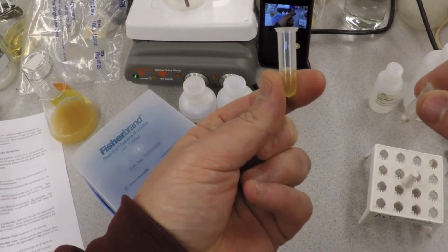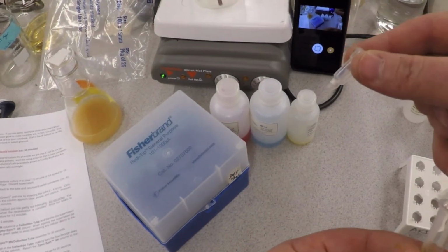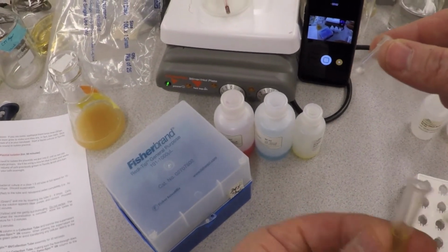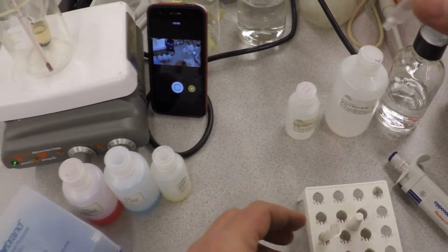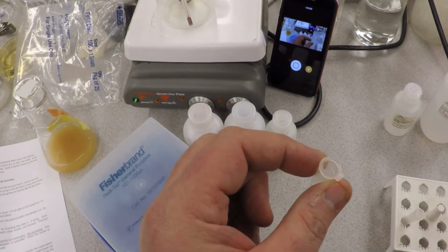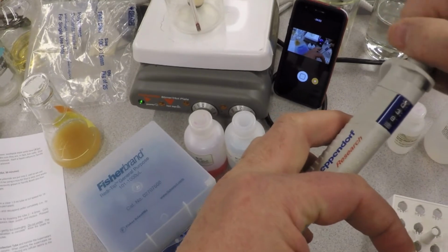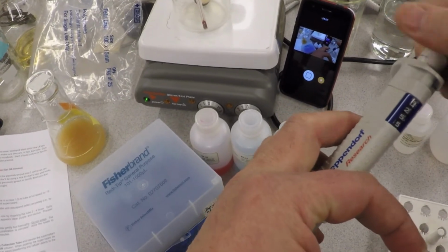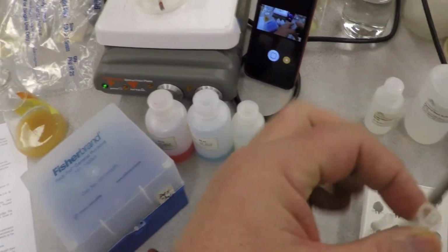Because now this stuff is stuff we don't want. This has got all the extra stuff. Our plasmid should be stuck on that little white stuff. So we discard this. I keep the tube around because I'm going to use that little column later. But it says here, add 200 of Endo wash buffer. So Endo wash buffer is basically washing your little plasmid, getting rid of various things you don't want in there.